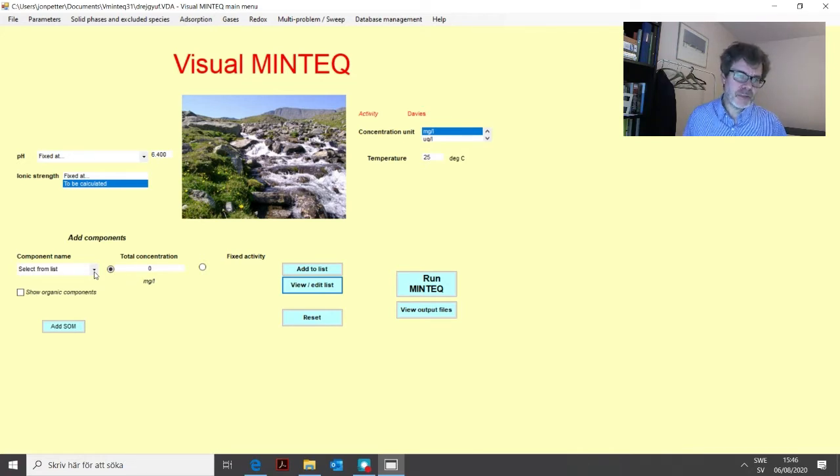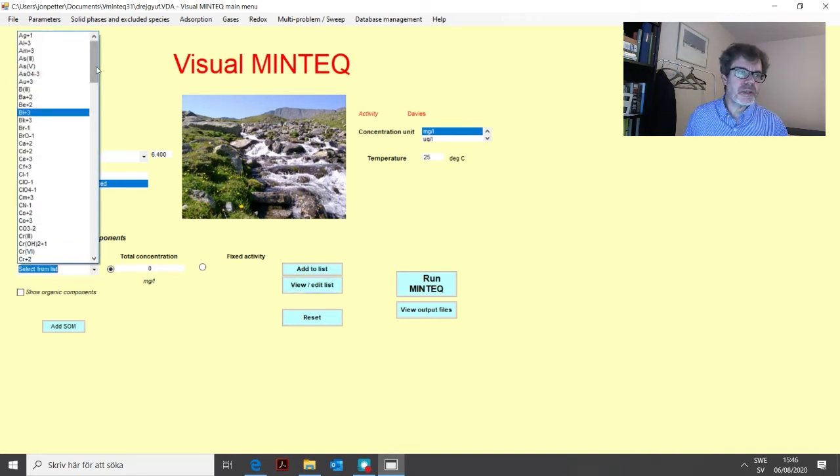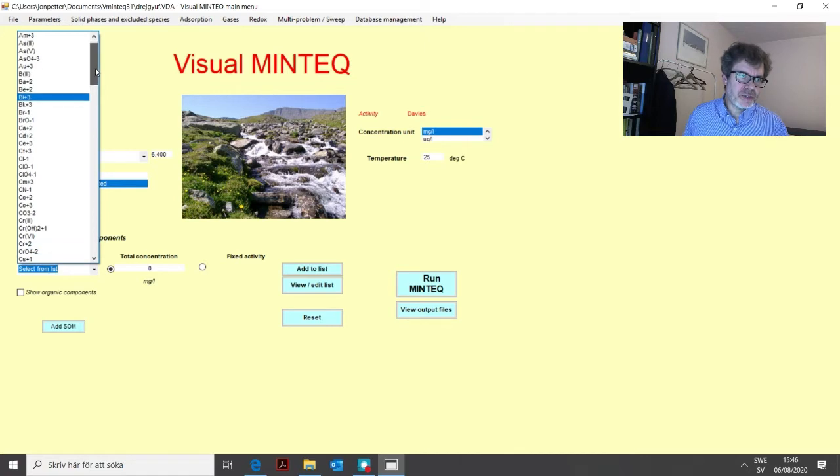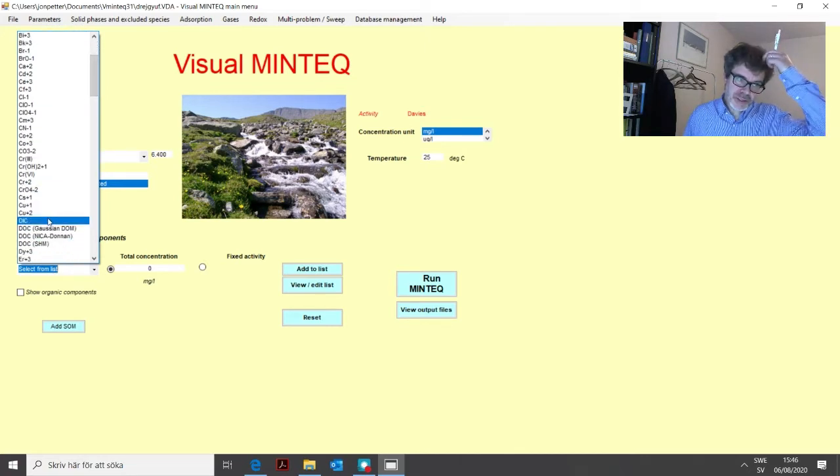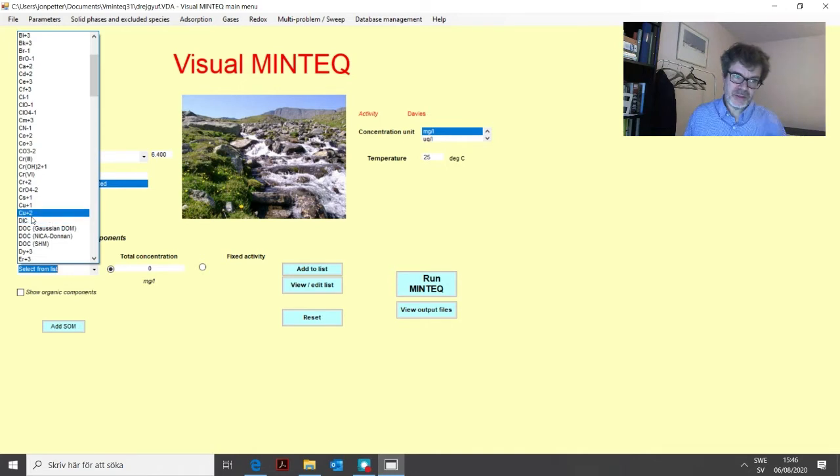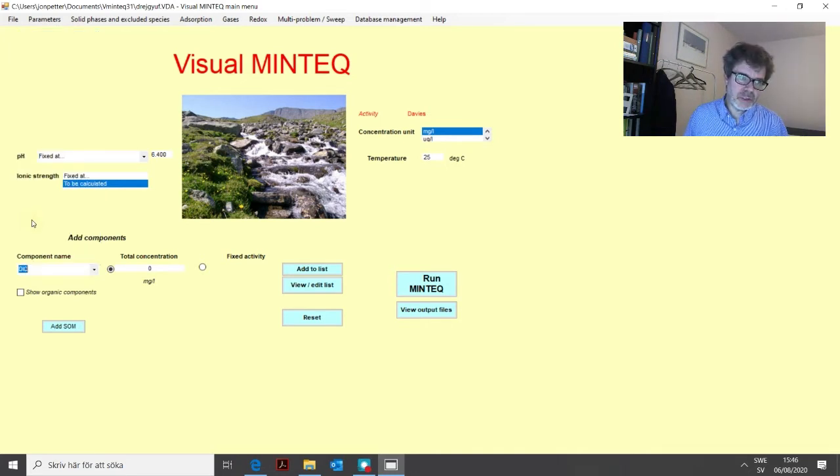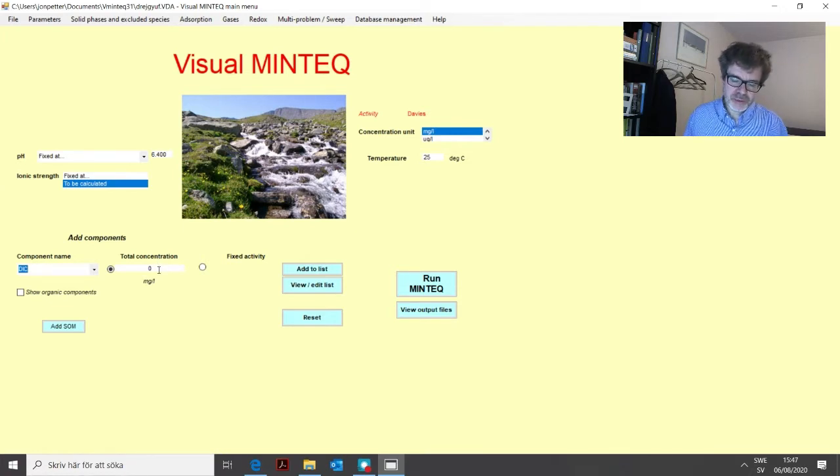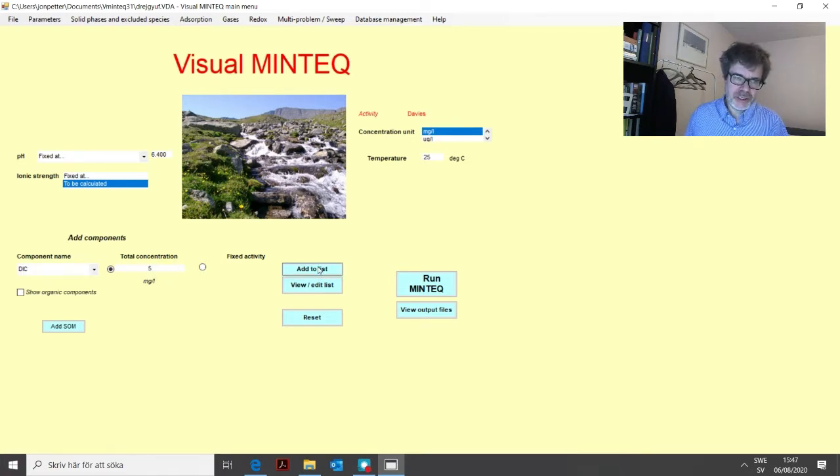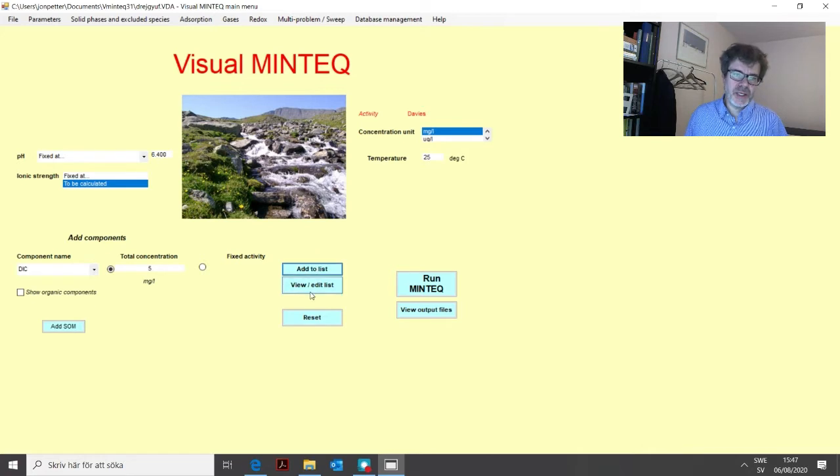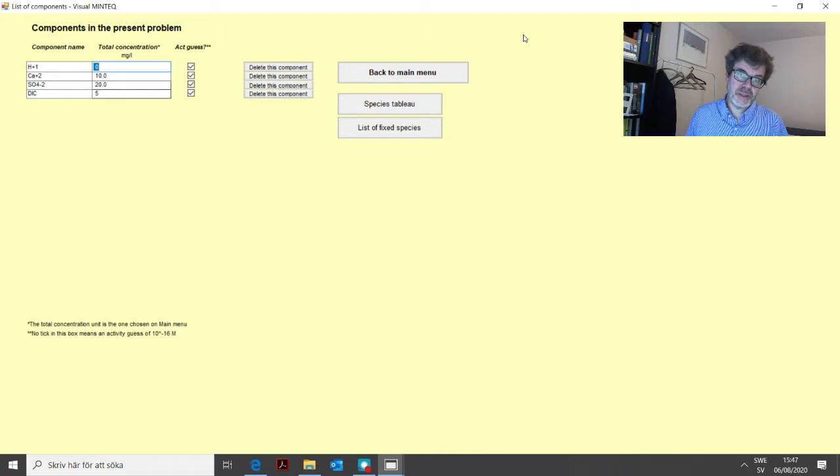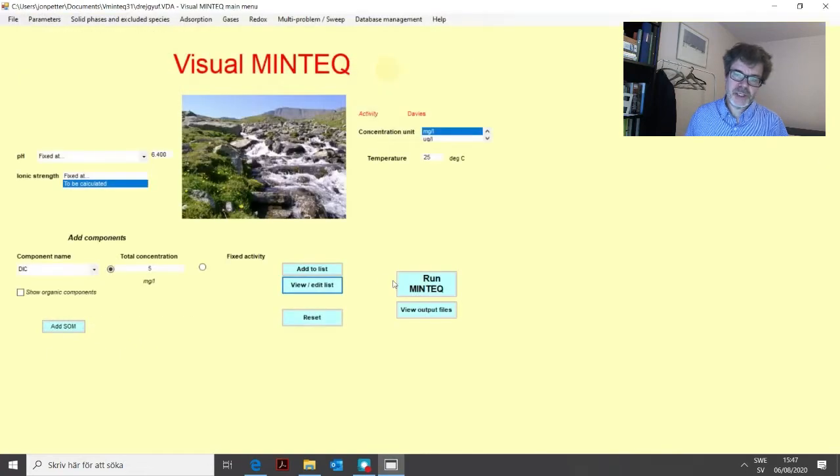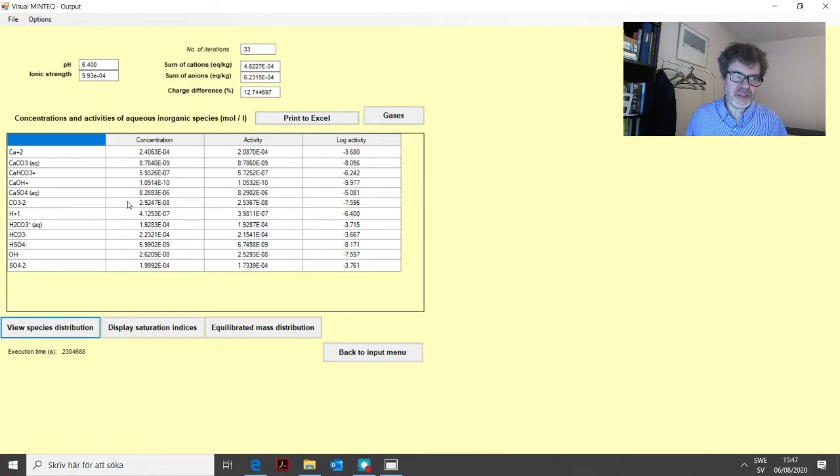If you have carbonate measured in this way, you can click this list and then you find here DIC. DIC is actually dissolved inorganic carbon. So if you have it, for example, five milligrams per liter of that that you have measured, you just enter five here and then you click add to list and then you have defined carbon or carbonate in this way. If we run this problem, you'll see that we get carbonate as a result.